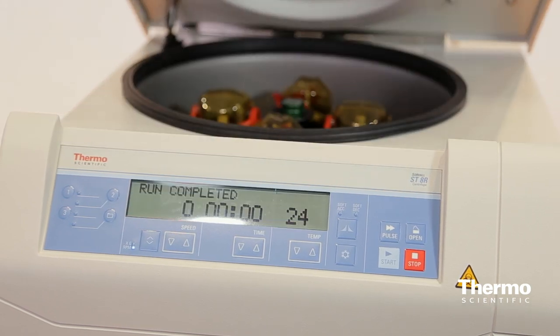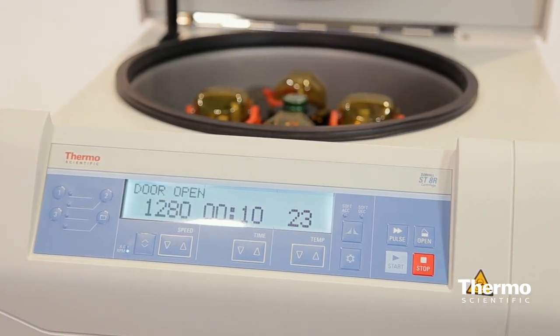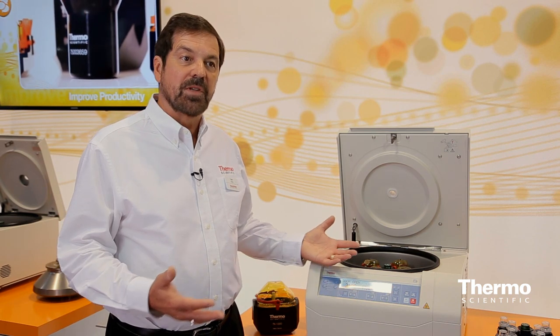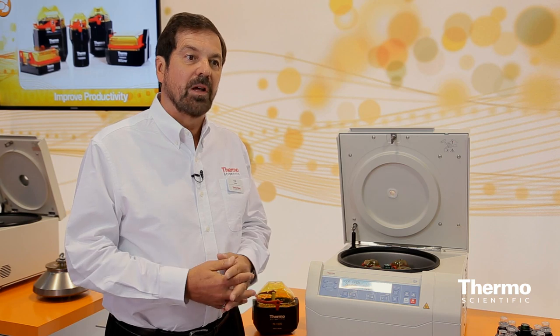We have this in a refrigerated version and in a ventilated, non-refrigerated version. We also have a whole range of product sizes, not just our new platform, all the way up to large and floor model platforms. You can find all the information you need on our new products at thermoscientific.com on the centrifuge landing page area.